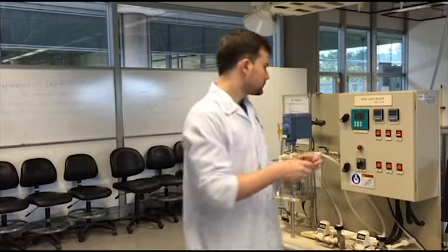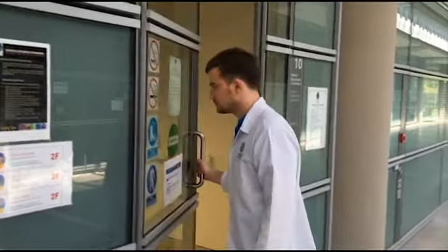For the third error and recommendation part, the reading of the conductivity of the solution in the batch reactor is fluctuating with time. So in order to solve this problem, we need to repeat the experiment several times to take the average value for the conductivity. So I hope these recommendations will help to minimize the errors in the experiment and improve the results in the future.